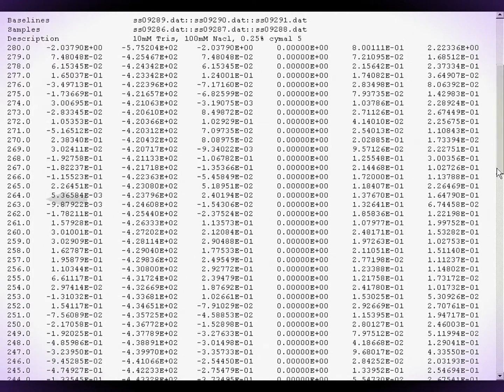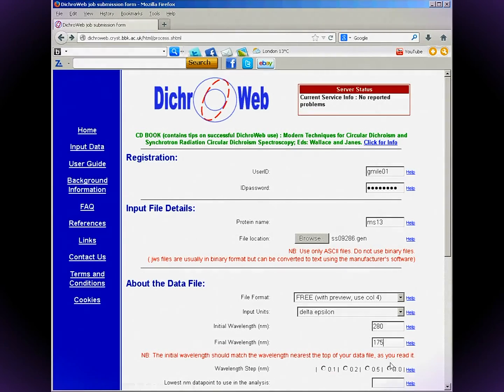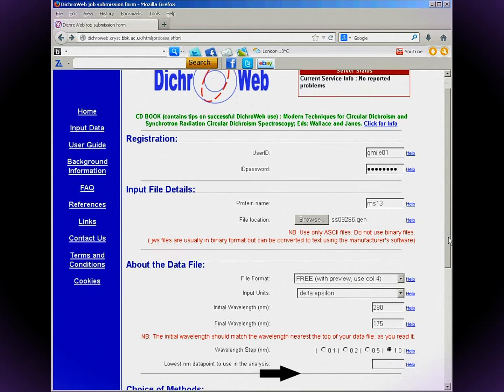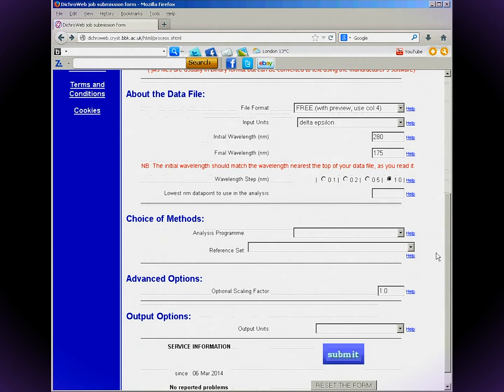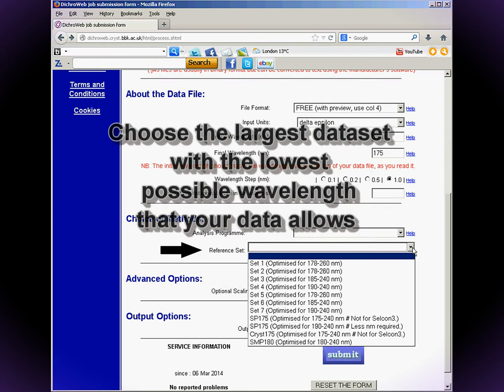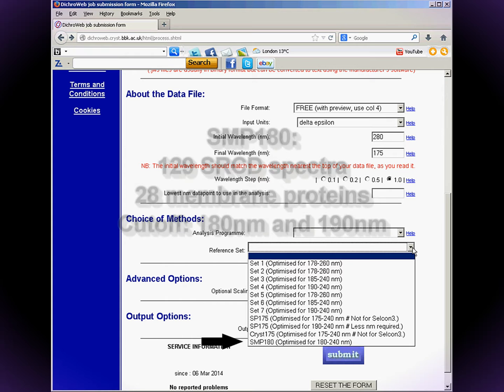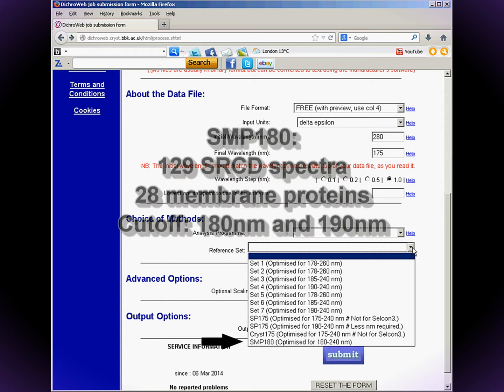Enter the first and last wavelengths of your spectrum — this is usually the highest wavelength and the lowest wavelength in your data. Enter the wavelength step; it's usually one nanometer. Now go to the reference set drop-down list. It's best to choose the largest reference set but with the lowest wavelength cutoff your data allows. SMP180 is the broadest range, including both membrane proteins and soluble proteins.